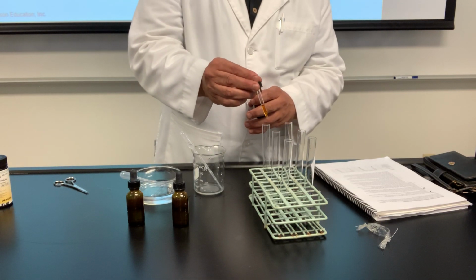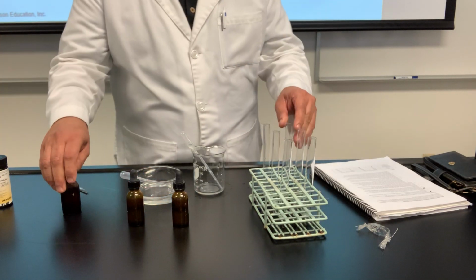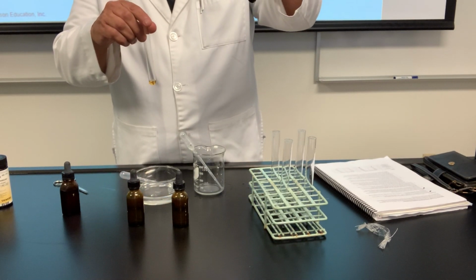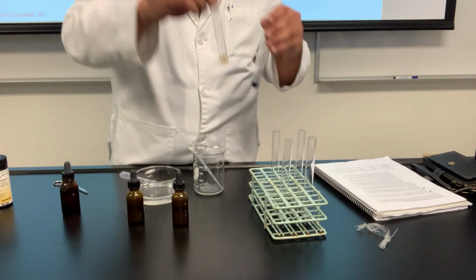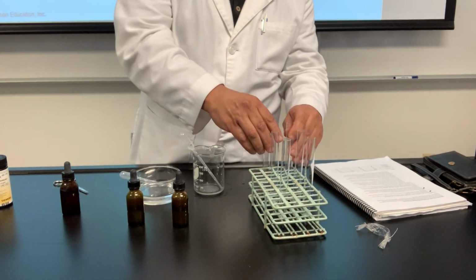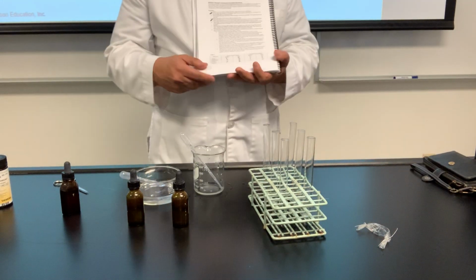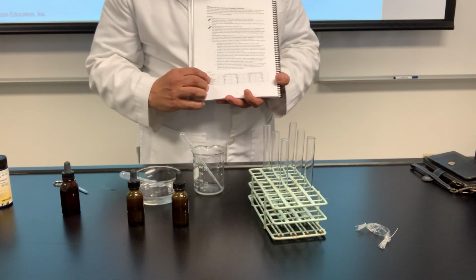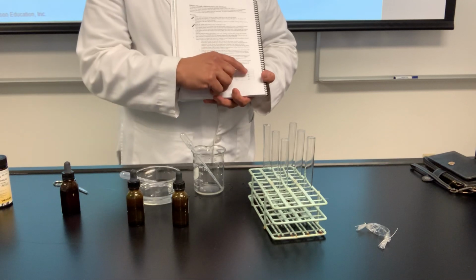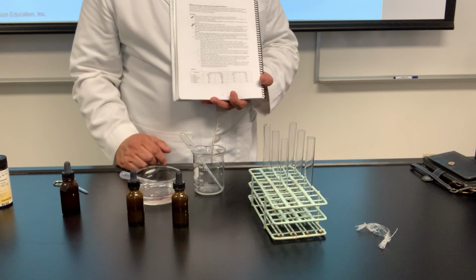Don't fail me now. Don't embarrass me now. Ooh, thank God, but I'm not done yet. Oh, good. Look at that. The inside solution has starch. Yeah, we know that. Did it leave? No. It did not leave. Mix it up. Well, here, it didn't leave. All right. Okay, so here's what we're going to do. We're going to record starch after dialysis plus inside, after dialysis minus outside. Are we catching that? Because that's what it's showing.